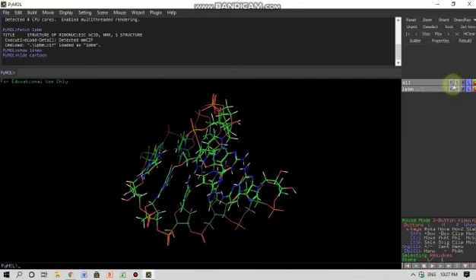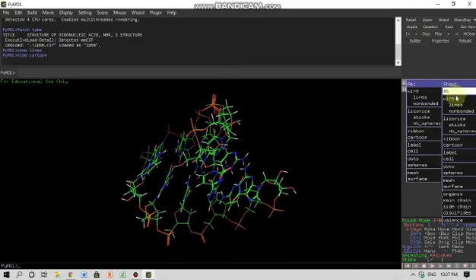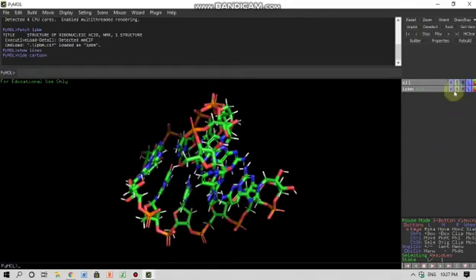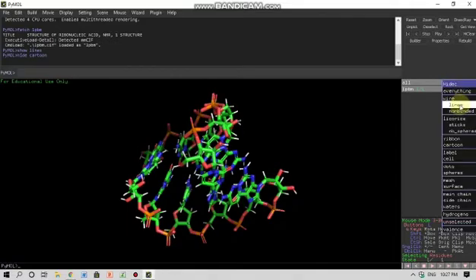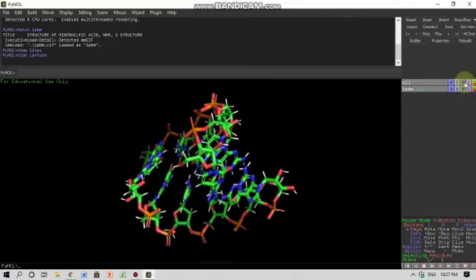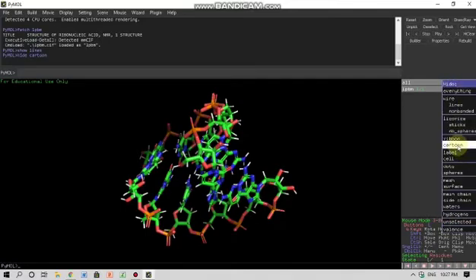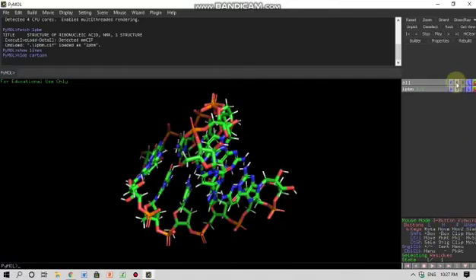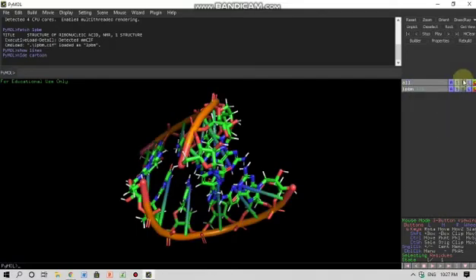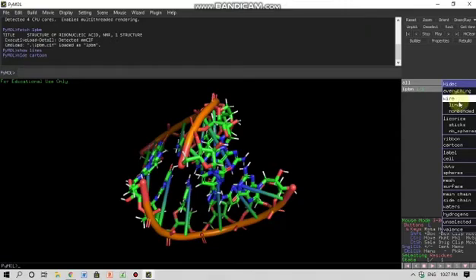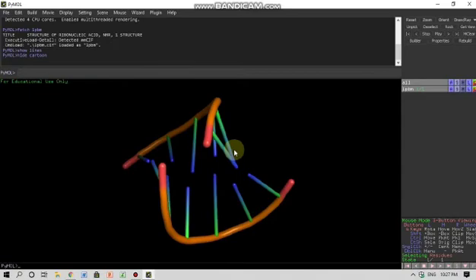I can also change it from here. I can click on show and I want to see the thing in sticks. I don't want to see it in lines so I can just click on hide and lines. Yes, okay. I want to show it in cartoon and I don't want to see it in sticks. So yeah, there you go. Okay, so we can change the shape of the molecule the way we want.